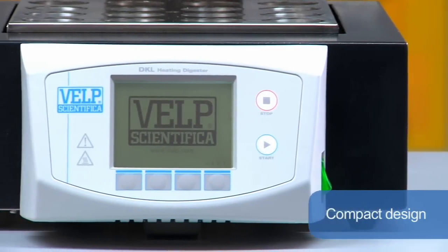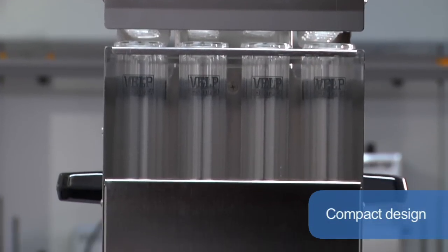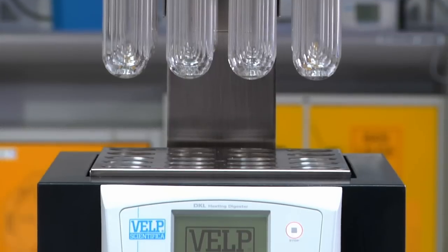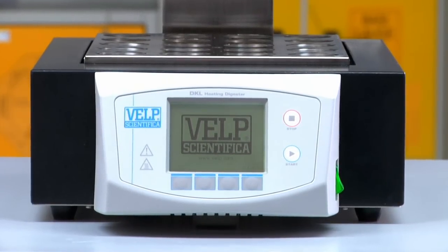With the most compact design, there will be plenty of space on the workbench for your samples. Ease of loading and unloading make the DKL digesters an extremely safe solution when carrying out Kjeldahl analysis.